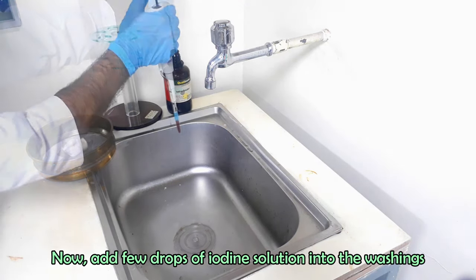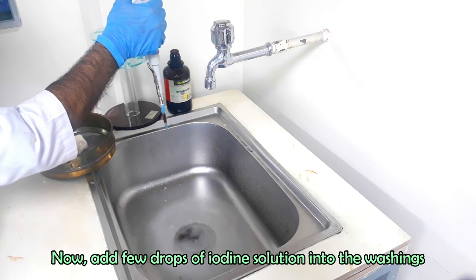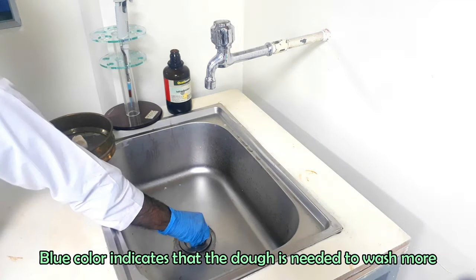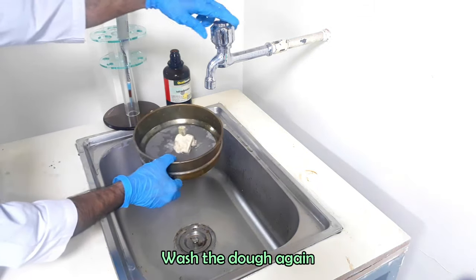Now add few drops of iodine solution into the washings. Blue color indicates that more washing is needed. Wash the dough again.